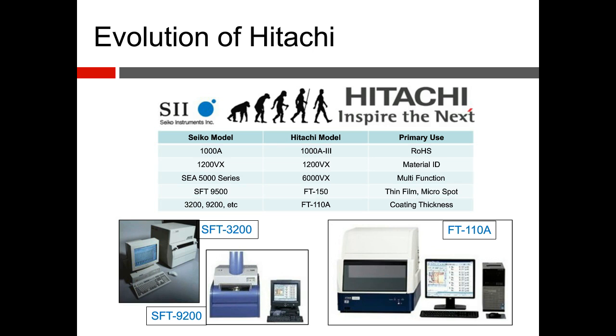But today we will be focusing on proportional counter systems for coating thickness applications. Anybody that knows Seiko knows the Seiko SFT3200 and SFT9200. That has evolved into the FT110A that you see there. And that is the software that we'll be reviewing today. And just aside, the software across the board for Hitachi is very similar, very streamlined.